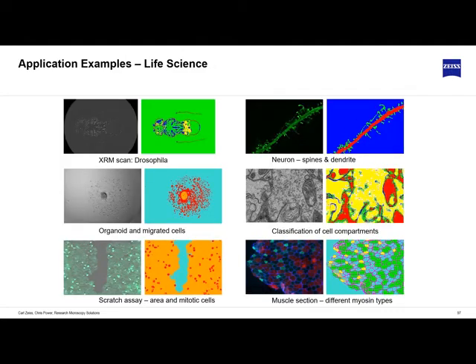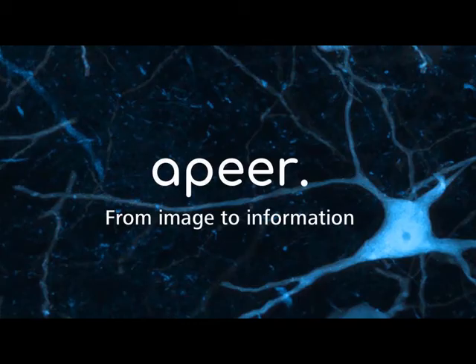It will work on pretty much any life science data, particularly those where you have poor contrast or hard contrast, such as in DIC, maybe in EM, but fluorescence, it works very well. So far, so good. Again, we want more. So the last thing I'm going to mention in my talk is APEER.